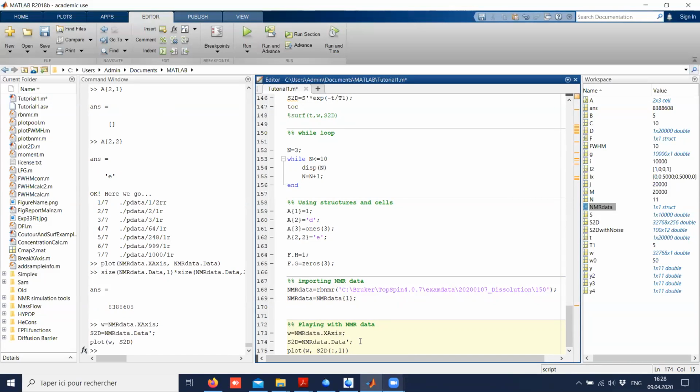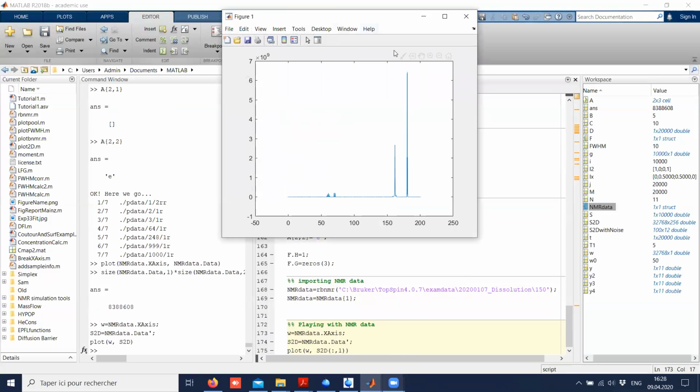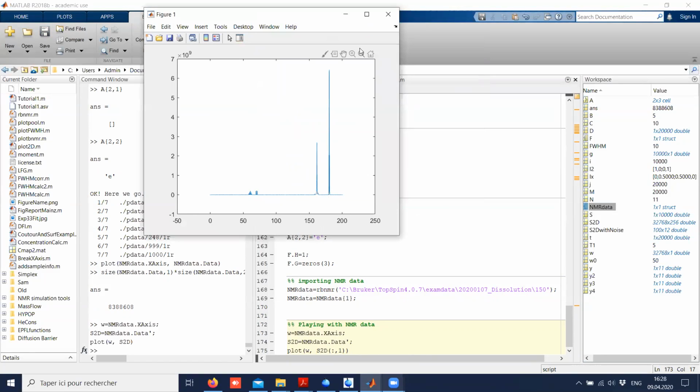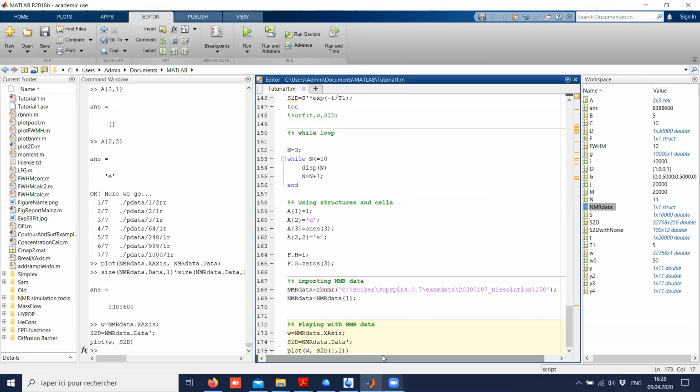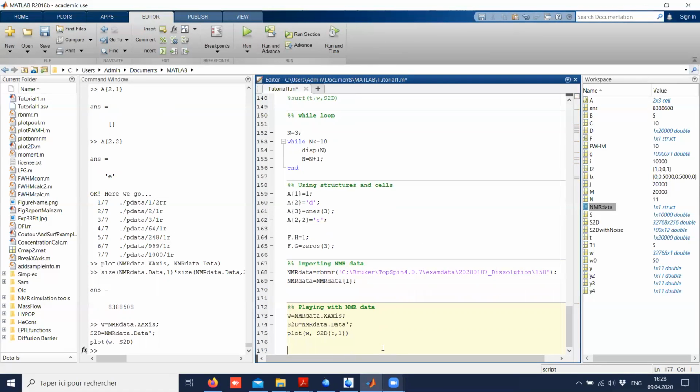I do this because now I can run this code simply by pressing Control Enter, I guess. So now I only have one element on this plot. You see, for example, this nice hyperpolarized signal. Now let's see a few examples of the things we can do.